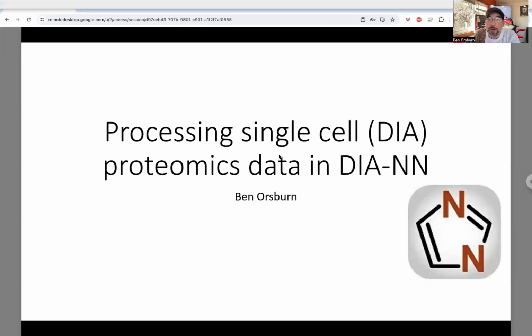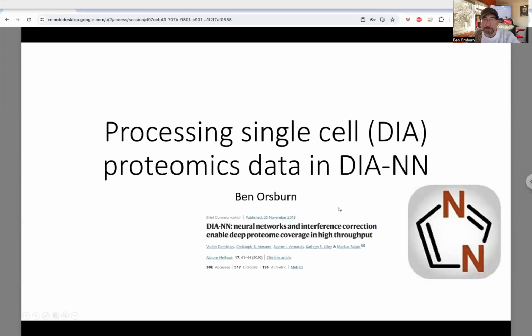Hey guys, okay, so as part of this collection of videos, I'm going to run through just a quick overview of how to process single cell data in DIANN. And of course, you're probably familiar with DIANN, and I have nothing to do with DIANN at all, except as a user. And of course, this is when we first heard of this.